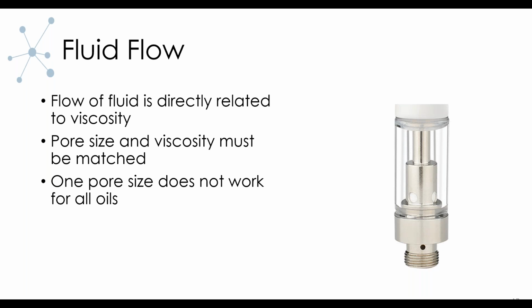And we see these forces also in the hardware used for vaping. Those forces occur at the pores. You can imagine as the cannabis oil is flowing into these pores, it's getting squeezed down into this opening, and that's a force, or a shear force.